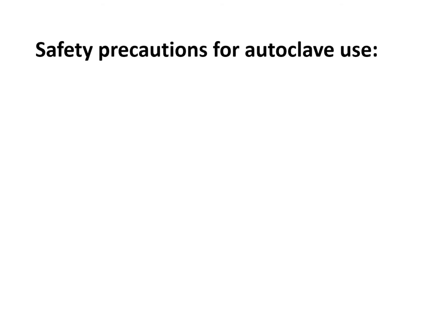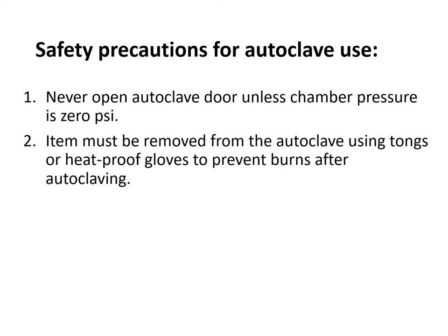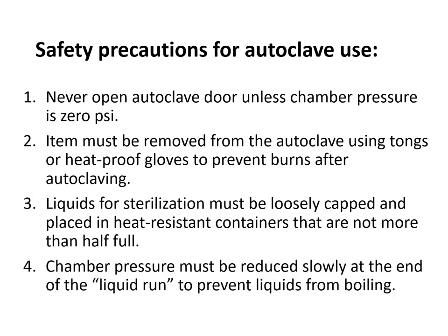Safety precautions for using the autoclave: first, never open the autoclave door unless the chamber pressure is 0 pounds per square inch — opening while pressure is still at 15 PSI and temperature at 121°C risks burns to the operator. Second, items must be removed using tongs or heat-proof gloves to prevent burns. Third, liquids for sterilization must be loosely capped and placed in heat-resistant containers that are not more than half full, to allow steam to penetrate completely. Fourth, the chamber pressure must be reduced slowly at the end of the liquid run to prevent liquids from boiling.